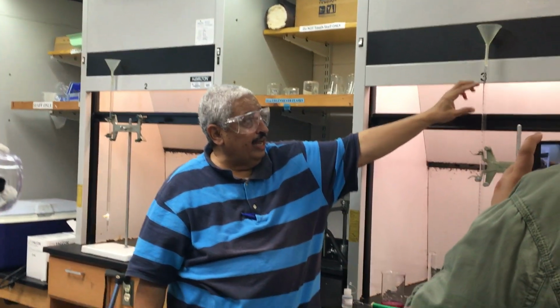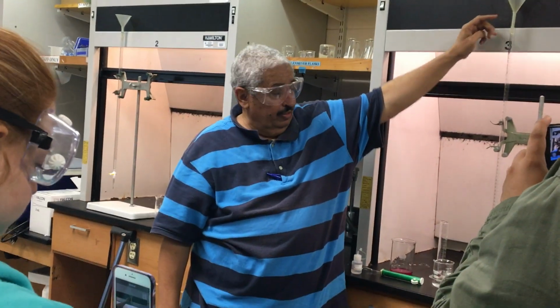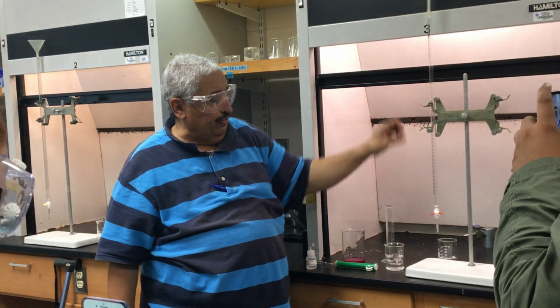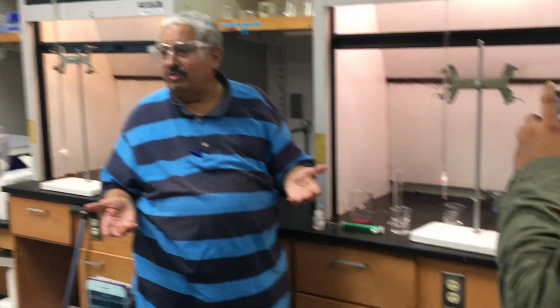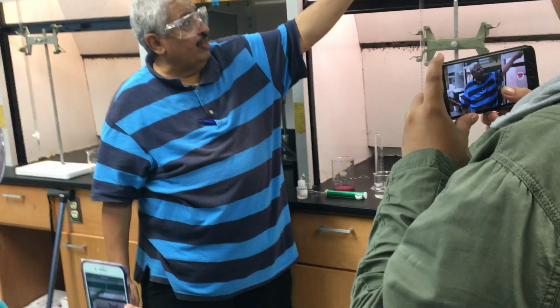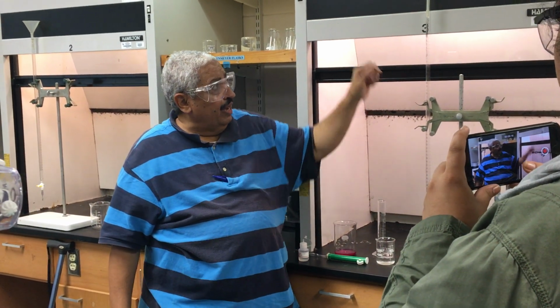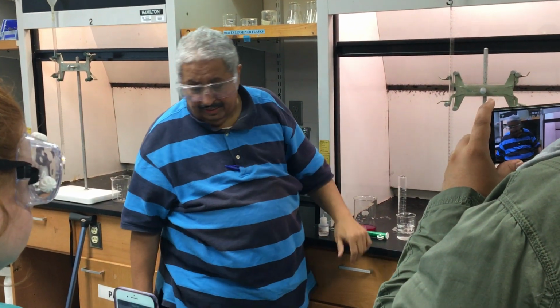So the burette has dead volume above 0. That's a 0 here. Above 0, I don't know, it's not calibrated. And the dead volume below 50 is not calibrated. It's calibrated between 0 and 50. If it goes beyond 0 or beyond 50, I have no use for this data. If it started above 0, this data cannot be used because I don't know what above 0 is. So my data has to be between 0 and 50. Above 0 is dead volume, it's not calibrated, and below 50 is not calibrated.